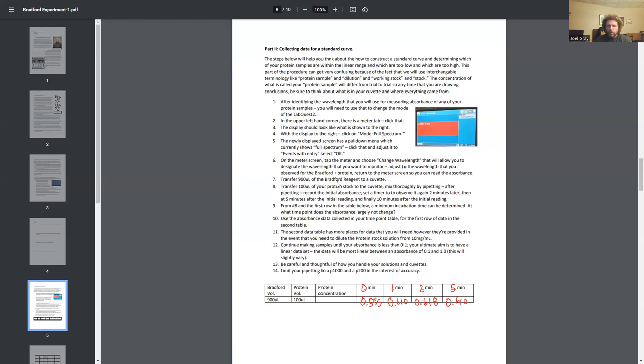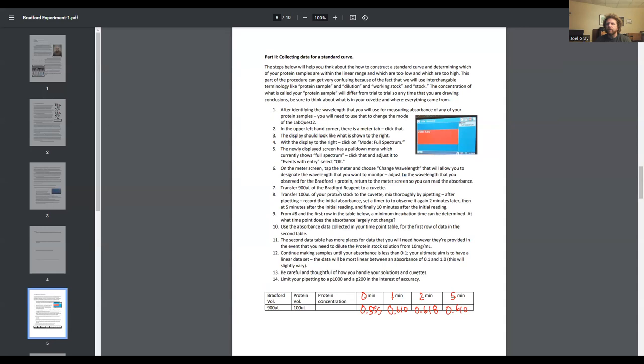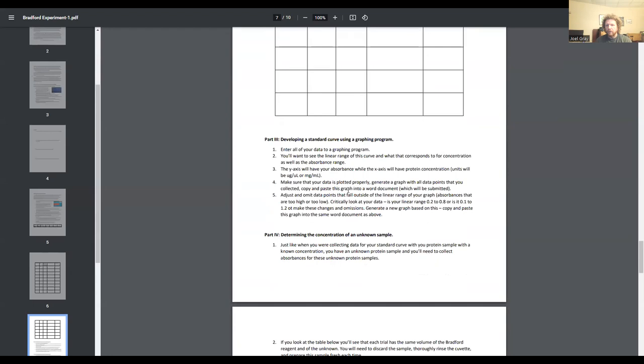Once you have an idea of, okay, I'm going to let it incubate for 2 minutes each time, keep that number in your mind. 2 minutes, that's the optimal time that you're going to do. Then after that, you're going to put together a data set.